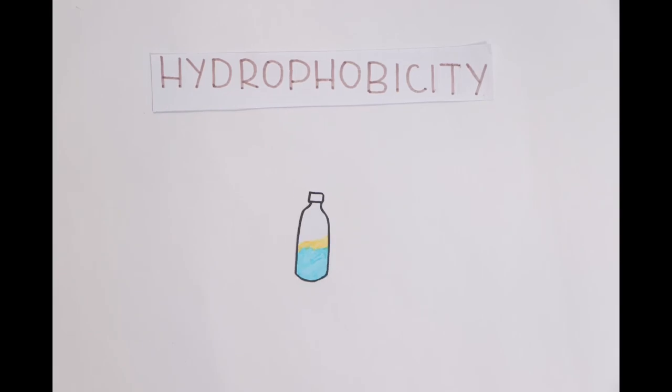HIC relies on the surface hydrophobicity of proteins to separate them. Do you know how oil and water do not mix? This is because oil is hydrophobic. Hydro means water and phobic means fear.